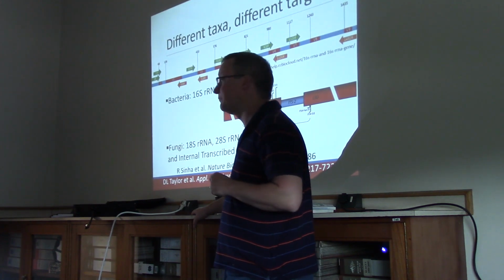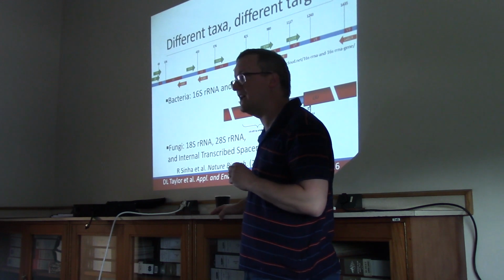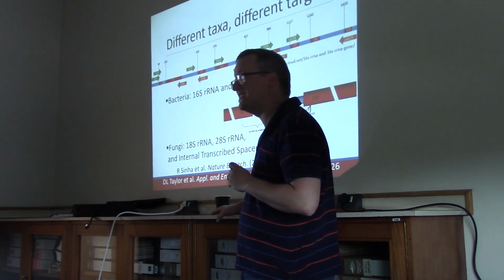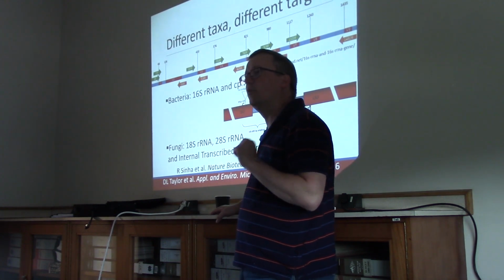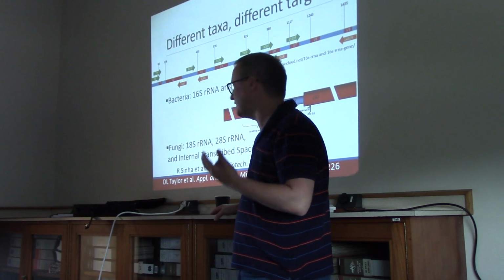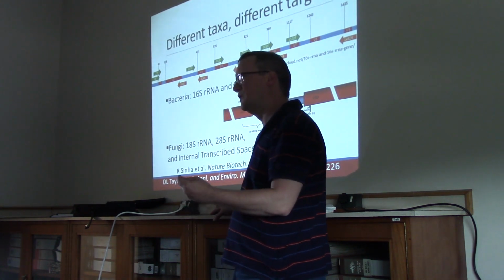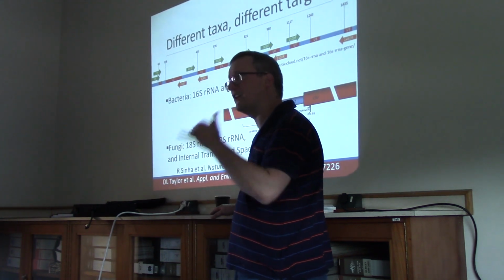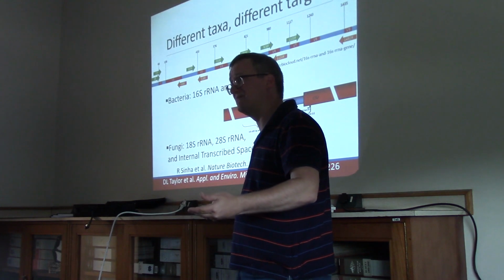Now in fungi, we frequently will work with 18S rRNA or 28S rRNA. Those are both viable. And yet, when people have done large-scale microbiomes in fungi, they've frequently found that they don't get enough information from 18S rRNA and 28S rRNA to tell them which fungi are present.